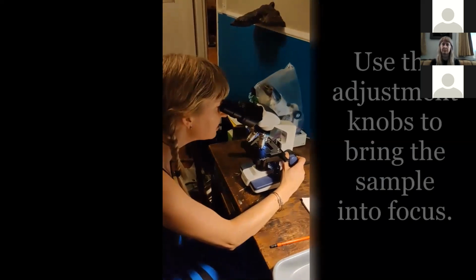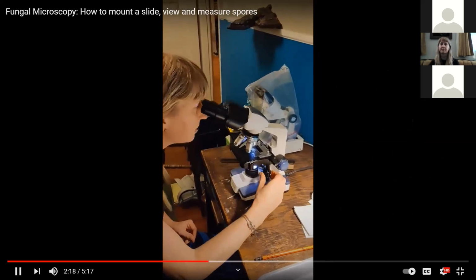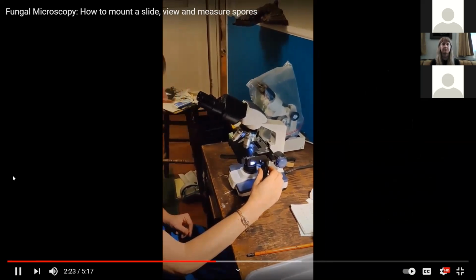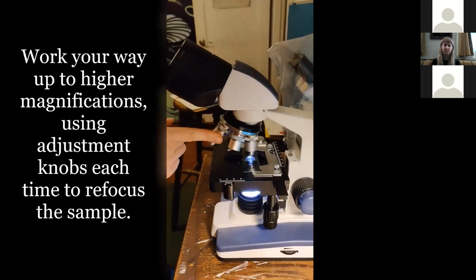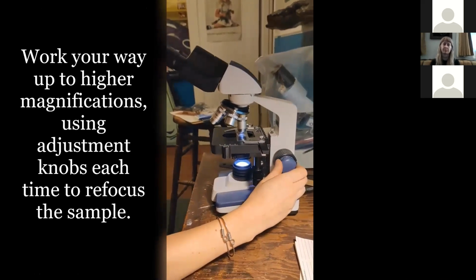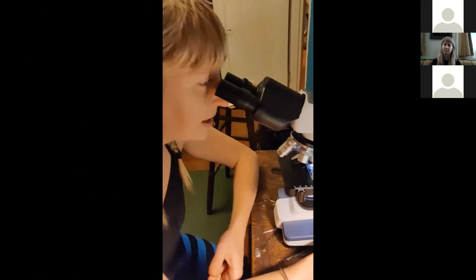And I'm using the coarse adjustment knob here first. There we go, until something comes into focus. And then maybe adjust a little bit more as needed. Okay, so I know that I at least have my specimen in focus now. Something is on there. And then I'm going to go to a higher magnification, so it's zooming in more. And then I'm using my fine focus again. Okay, so now I have my spores on the screen.